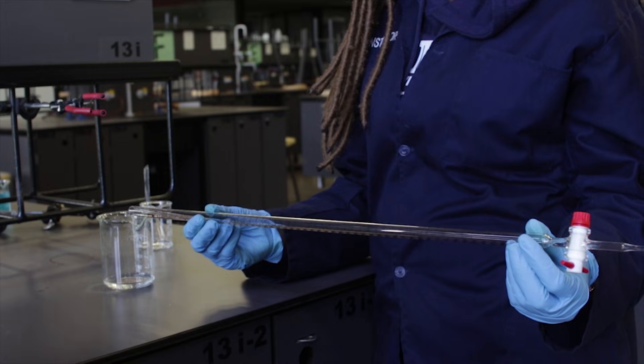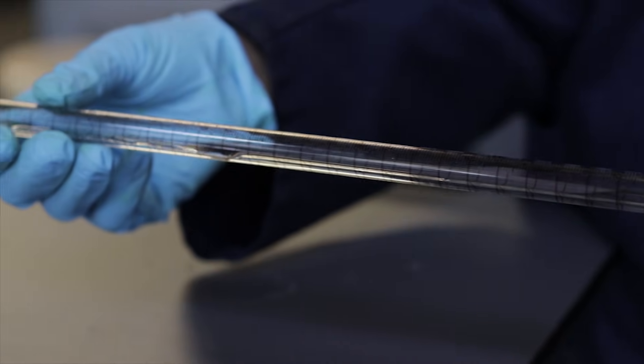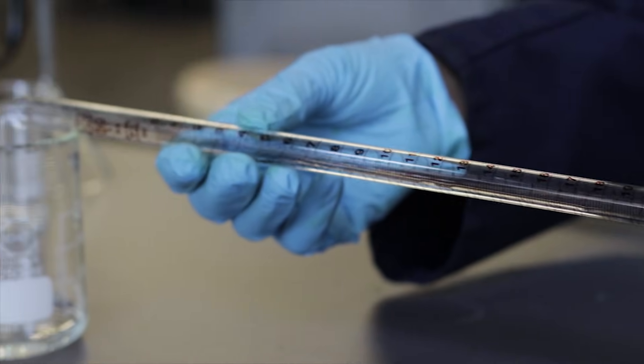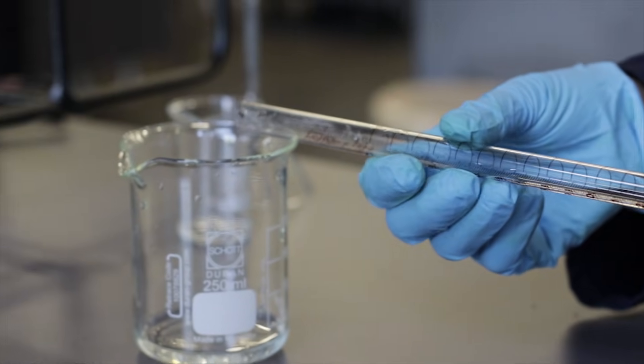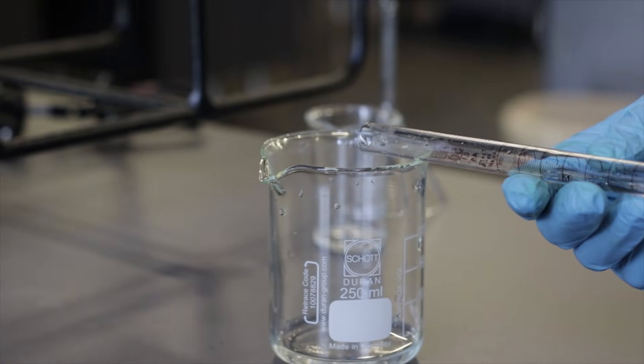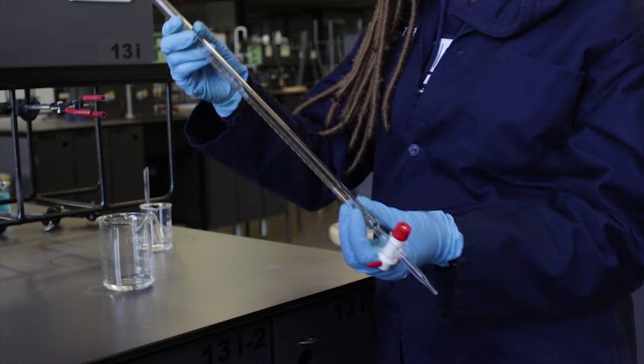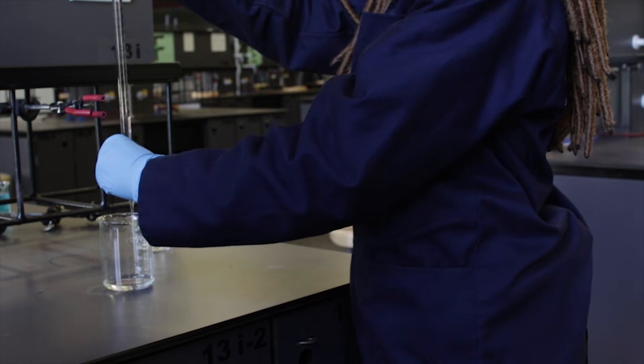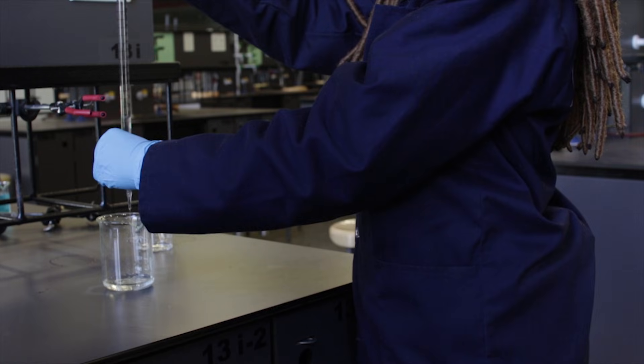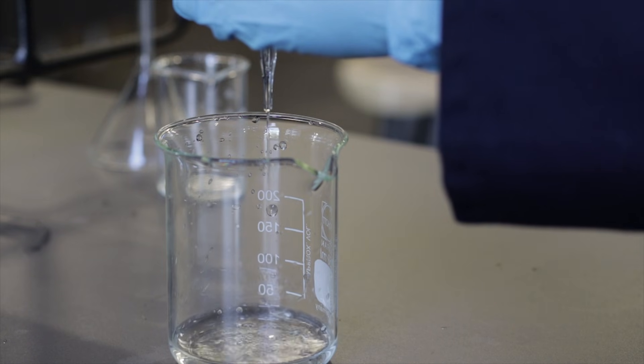The burette is then rotated to allow the solution to flow over the whole inside surface of the burette and the beaker is there to capture any solution that spills out of the open top end of the burette. The solution is then drained through the tap and this procedure is repeated an additional two more times.